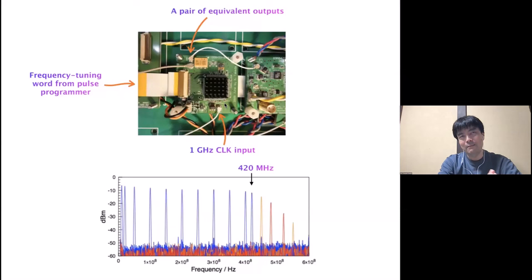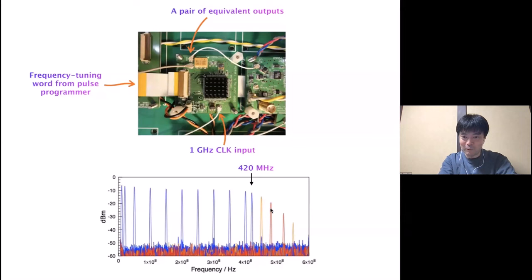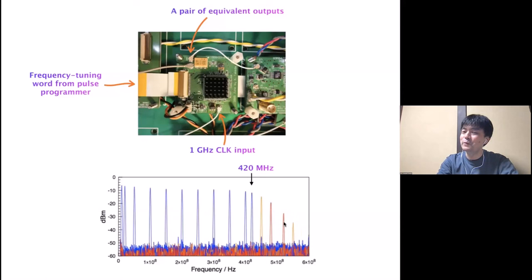For DDS, the maximum output frequency is around 0.4 times the clock frequency. We examined the output and found that up to 420 MHz the output is fine. At higher frequencies, such as 450 or 480 MHz, we have quite non-negligible spurious components visible as orange lines in the spectrum. This may also be removed by another filter.